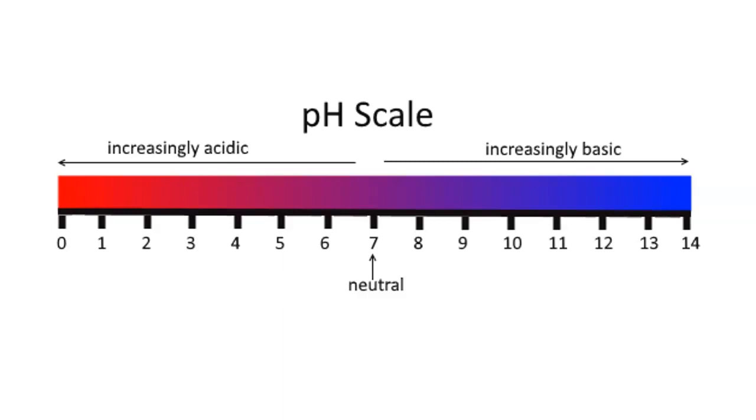Okay, so an acid-base indicator changing color indicates the reaction between the acid and the base is complete, and this is the actual endpoint of your reaction. So phenolphthalein is colorless below the pH of 8.0.